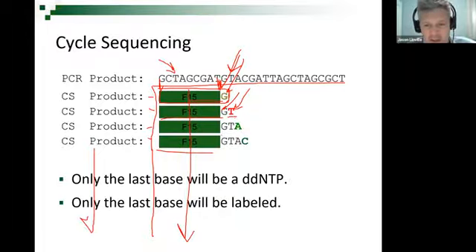Okay, this one right here adds a G, normal T, and then that third letter it adds is a special A. It stops. Okay. Now, again, normally what happens is it'll add about 100 normal letters before it grabs a special letter, and that special letter is at position 101, okay?